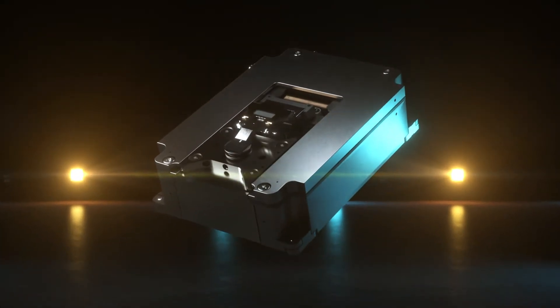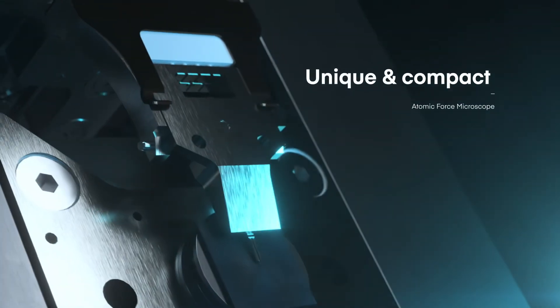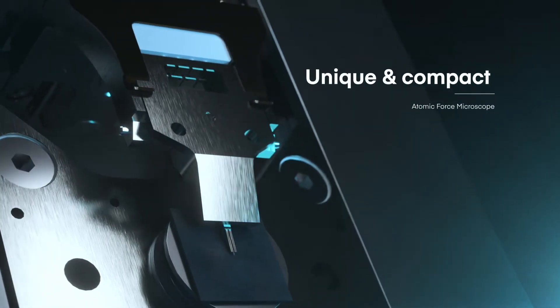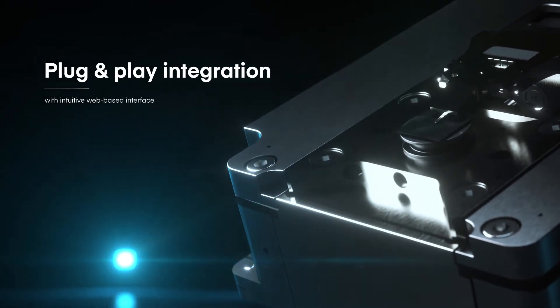That is why we have developed LightScope, a unique compact atomic force microscope designed for plug-and-play integration into scanning electron microscopes.